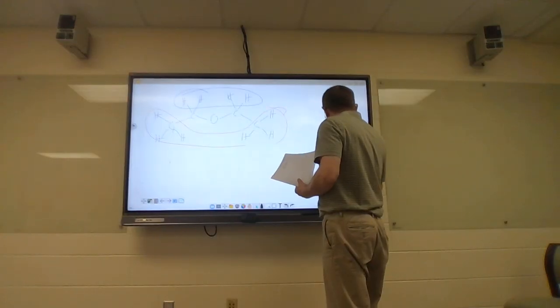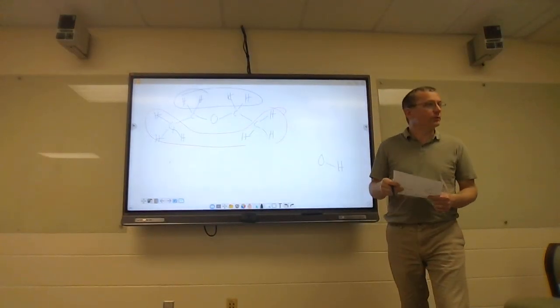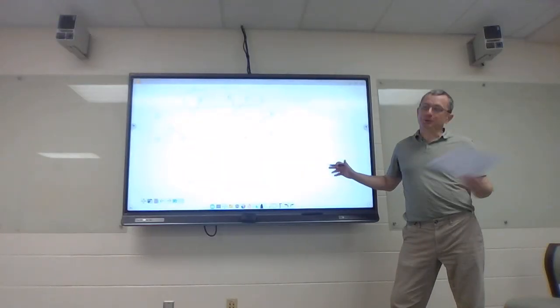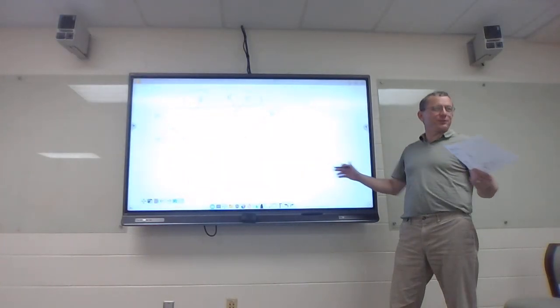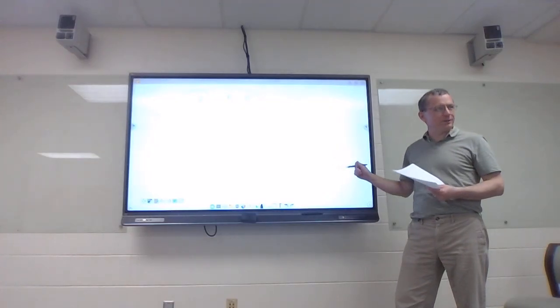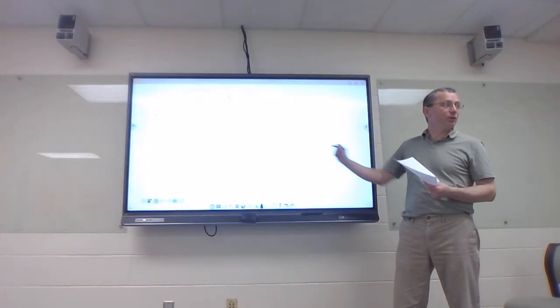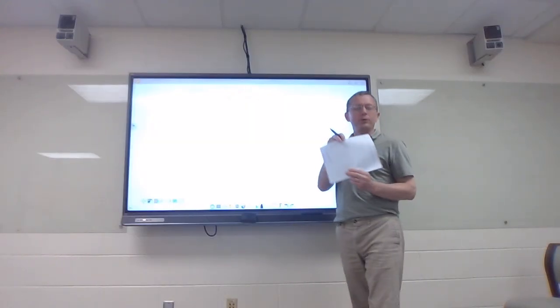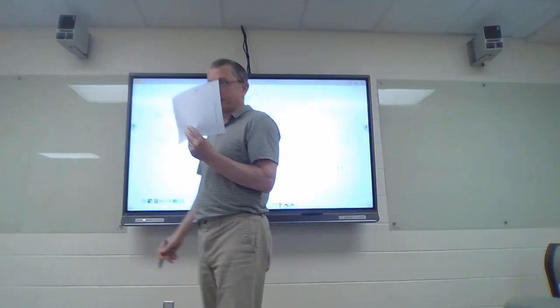To help answer really Julian's question, right? One of the ways I'll know, look at the IR. That's when I know I have an OH. And whether or not I see the OH in the NMR or not, if I saw it in the IR, I know it's there. All right, now looking at the NMR, notice this one now has 3 peaks instead of 2.